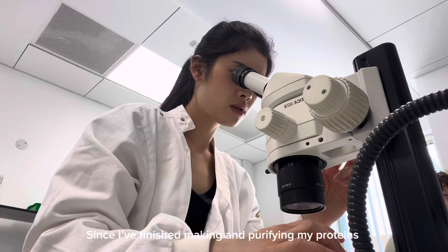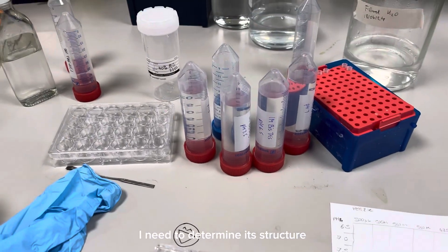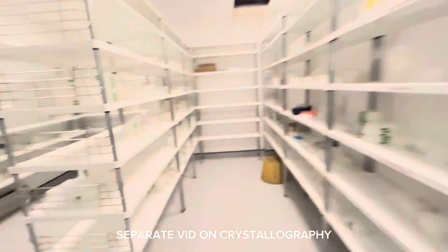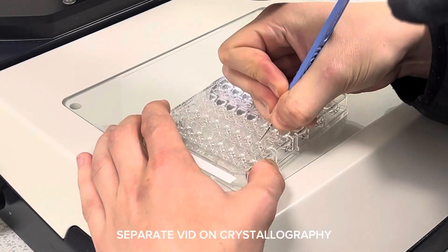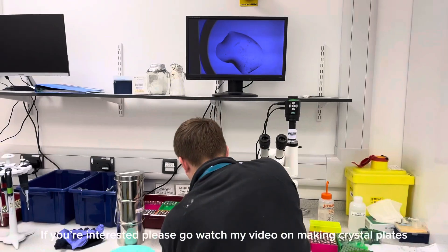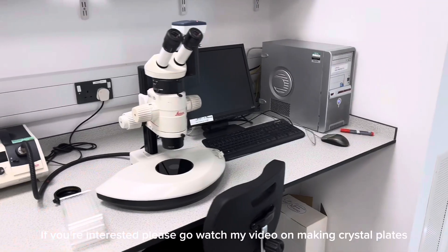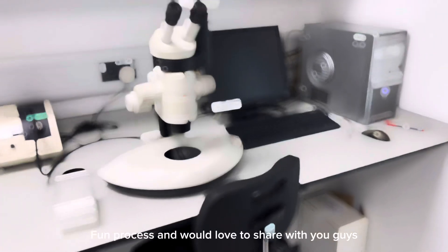Since I've finished making the protein, I will be determining its structure, and I'm doing it by X-ray crystallography. I will be making a separate video on how I do crystallography and how I make crystals. If you're interested in how to make protein crystals, please go watch my video — it's a very fun process and I'd love to share it with you guys.